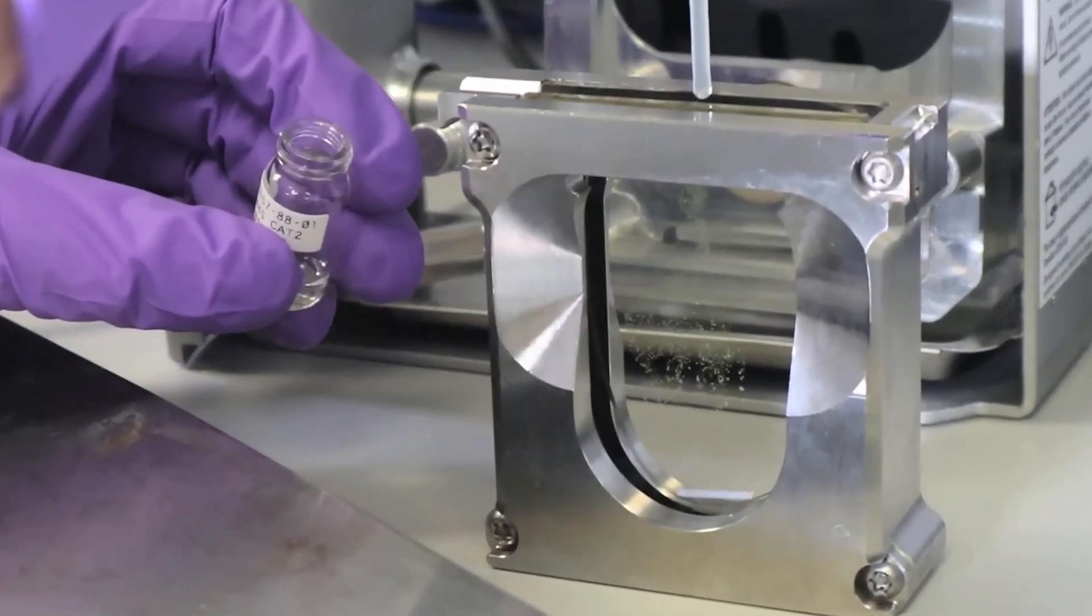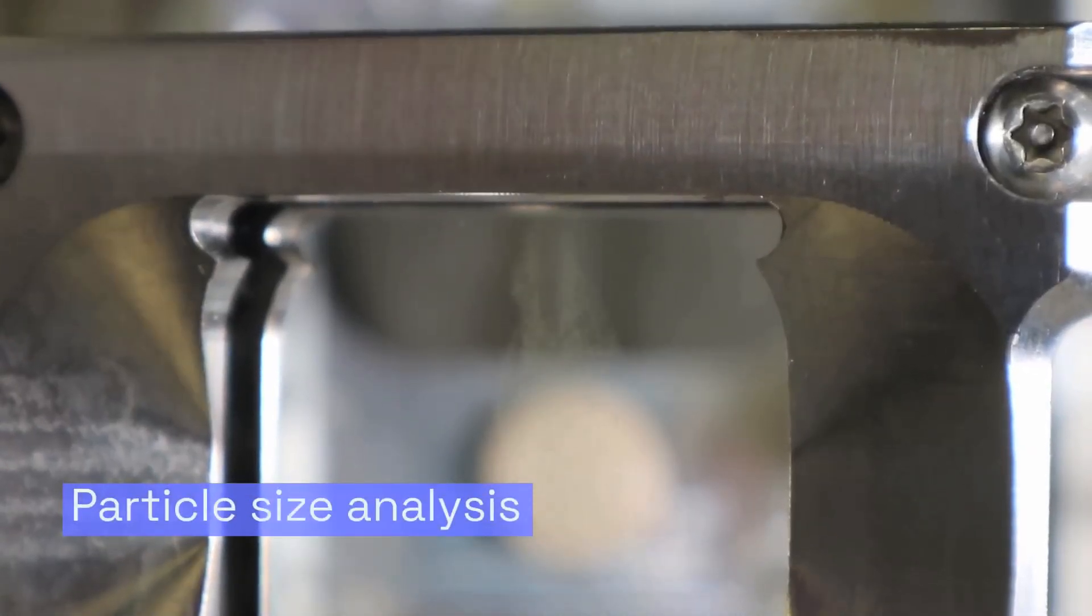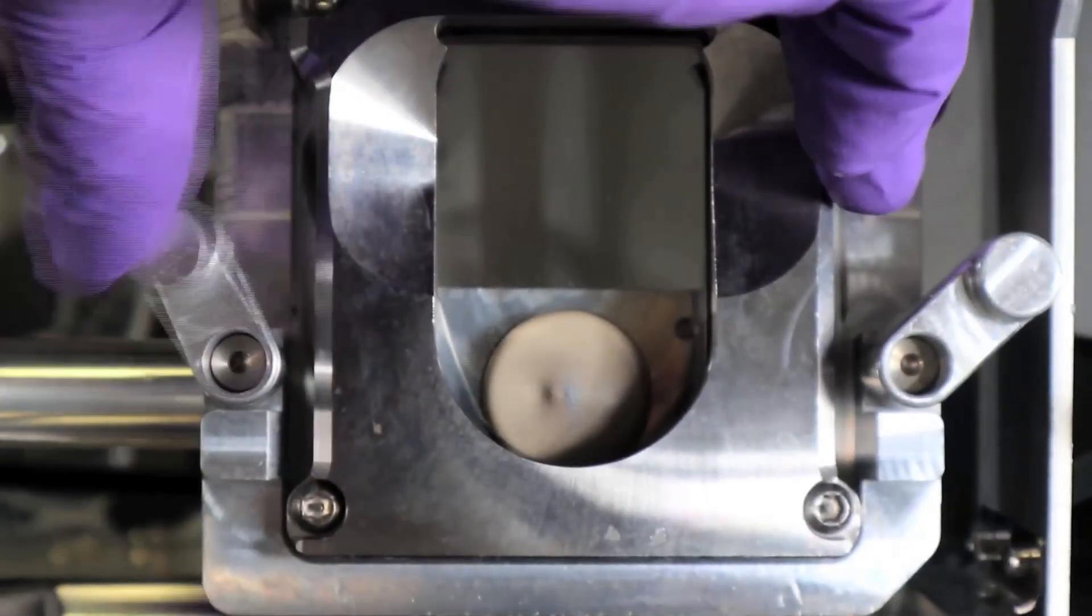Our milling capabilities are underpinned by our world-leading solid form services under the Pharmorphix brand. This allows in-depth analysis of the wet milled material ensuring that we have complete understanding of bulk and physiochemical properties.